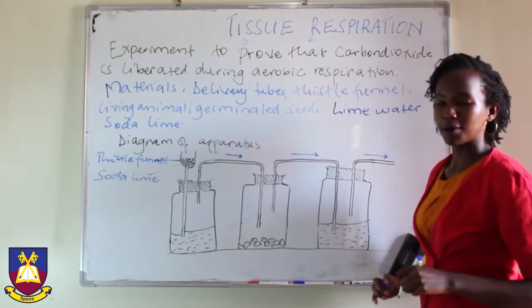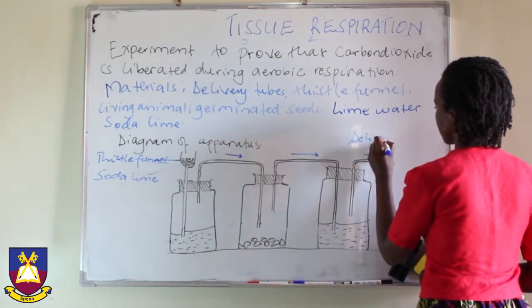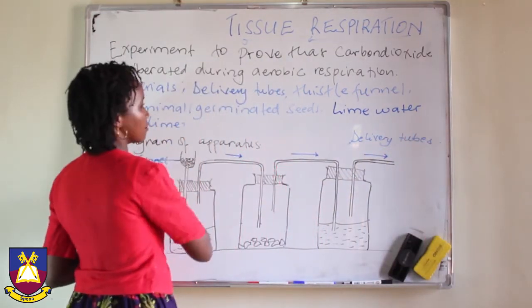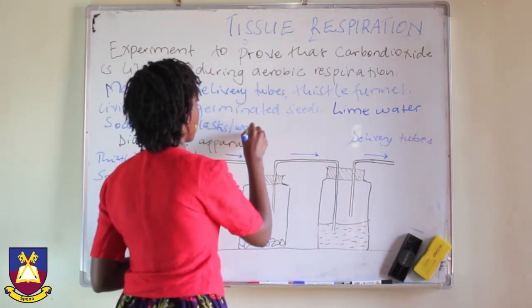We have our delivery tubes, 3 of them. Let's put them here. Flasks or wash bottles.